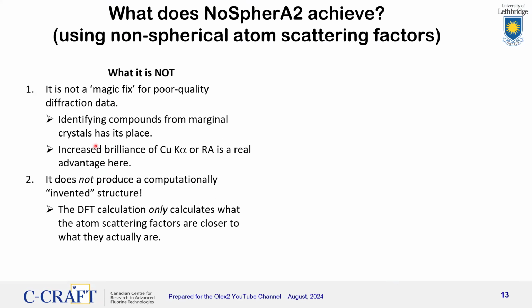Now, it's very important that we have clarity on what NoSpherA2 can achieve. Let's start with what it is not. First of all, it is not a magic fix for poor quality diffraction data.